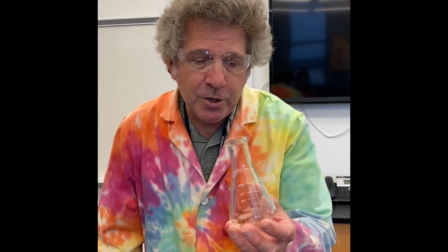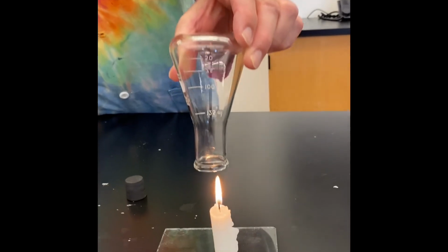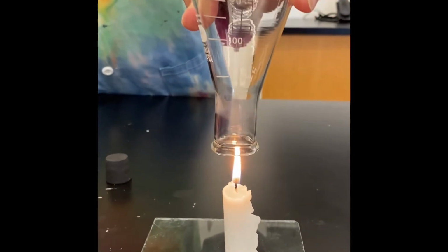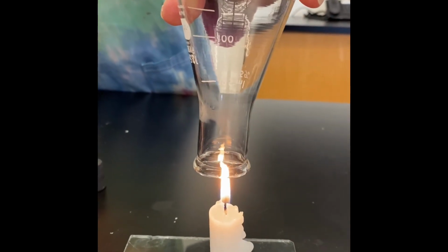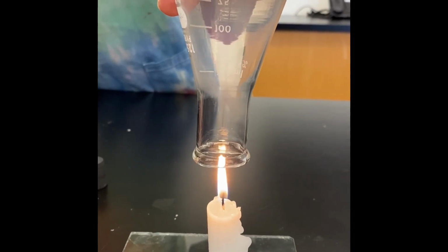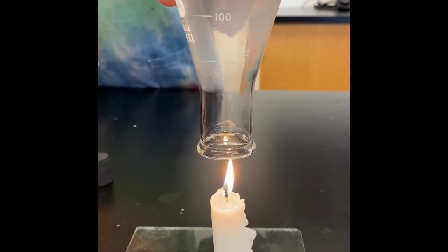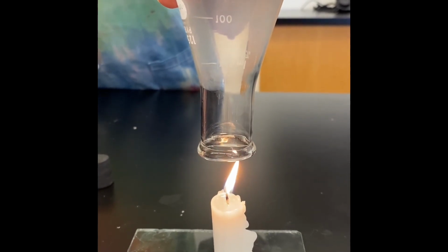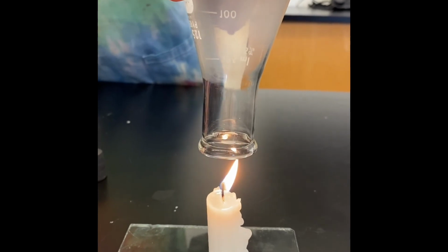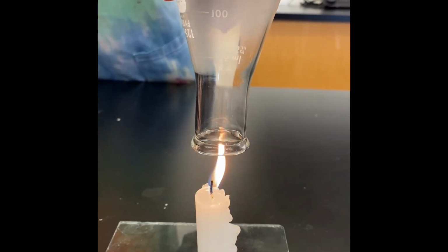Now I have an Erlenmeyer flask. And what I'm going to do is I'm going to take the Erlenmeyer flask and hold it over top of the burning candle, kind of like what I did with the beaker in the last step, for say about 30 seconds. And again, I'm just collecting some material from the burning candle into the flask. And I could clearly see it is collecting inside of the flask.